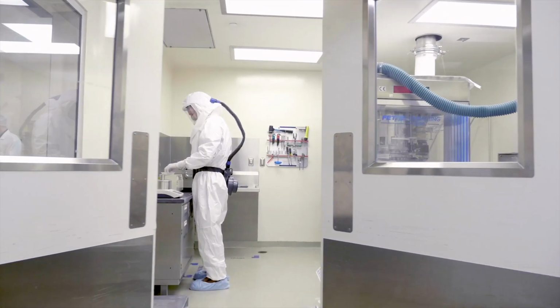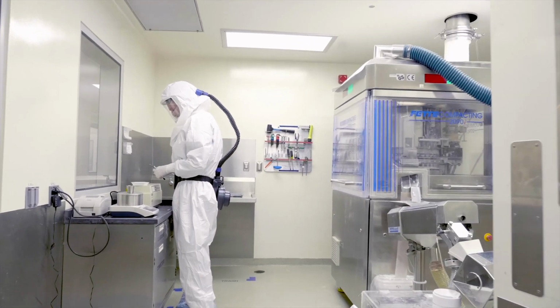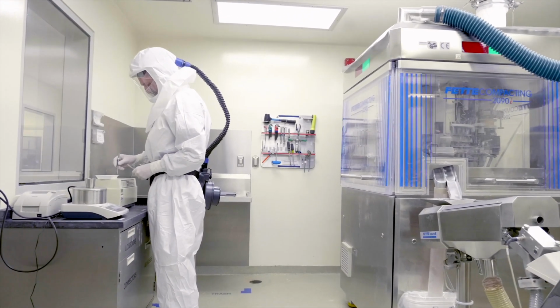Probably one of my greatest desires for a laboratory information management system, particularly one that captures experimental details in a structured way, is really relieving the burden of all that data collection, again, what I call data drudgery, from the analyst in the laboratory and having them focus on science.